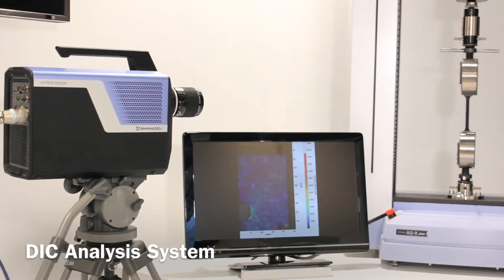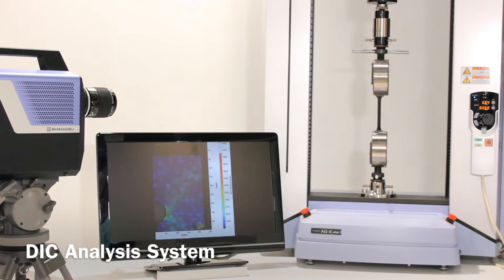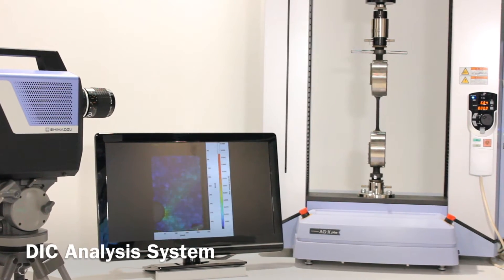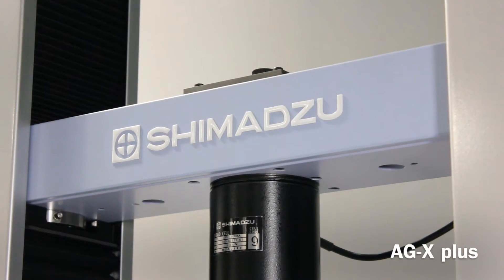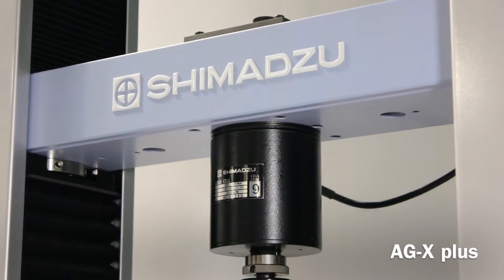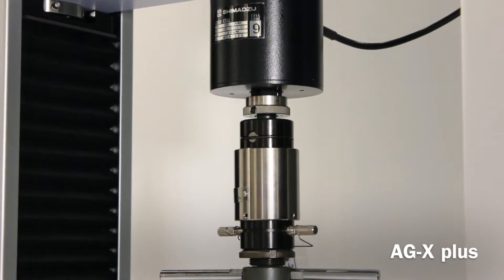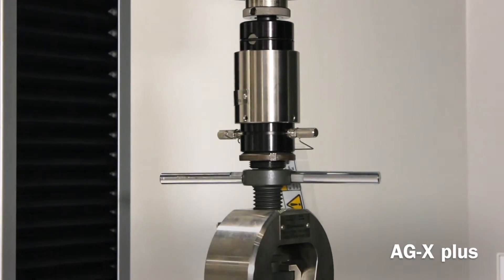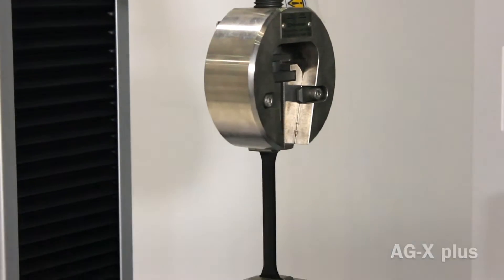Shimadzu's DIC analysis system is a strain distribution measurement system with ultra-high speed video camera HPVX and high-precision universal testing machine AGX+.